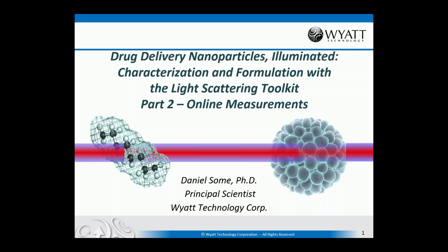Hello, and welcome to today's broadcast, Drug Delivery Nanoparticles Illuminated, the Light Scattering Toolkit Part 2, Online Measurements. This is the second in a two-part webinar series dealing with the application of light scattering to characterizing drug delivery nanoparticles, with a focus on fractionated measurements using SEC-MALS and FFF-MALS.